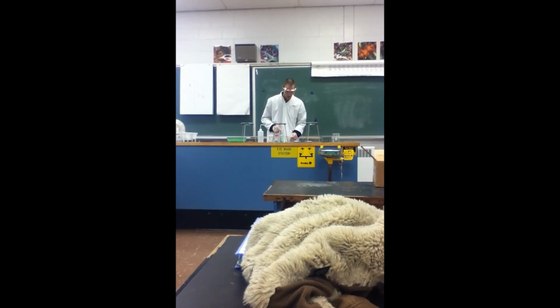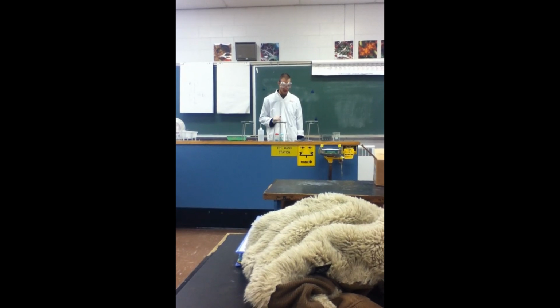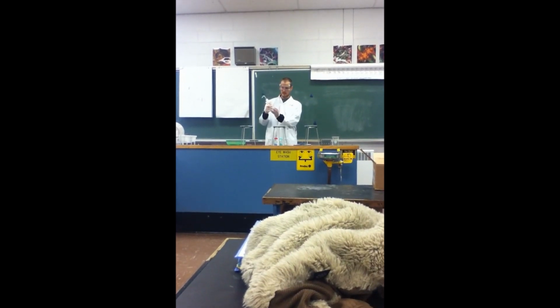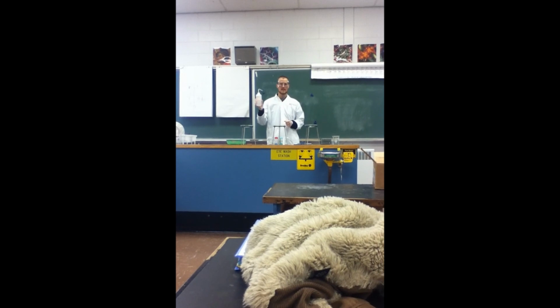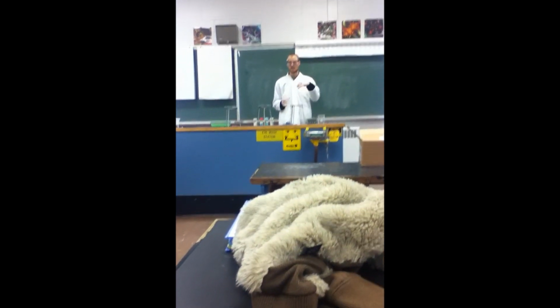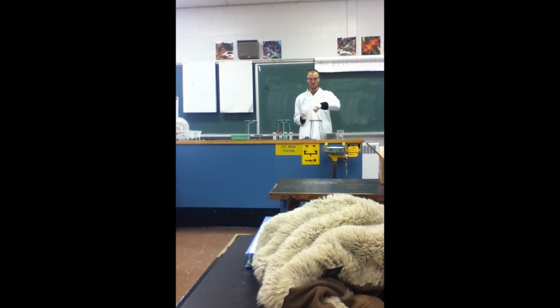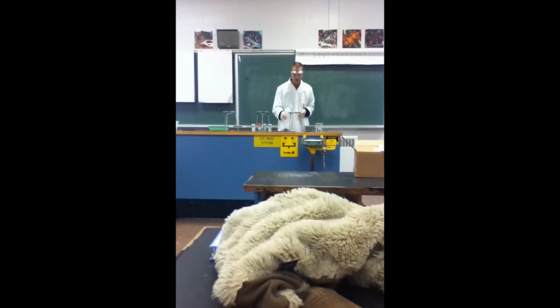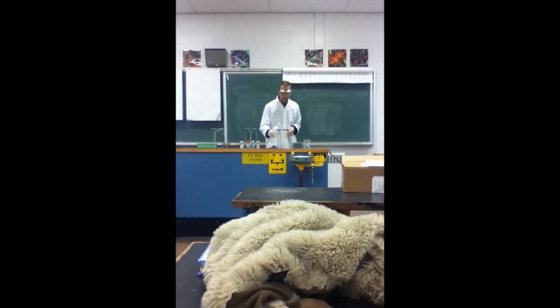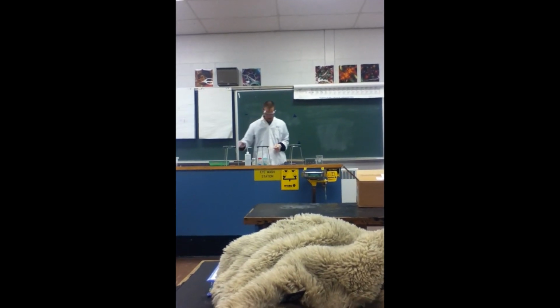Okay. All right, so we've tightened our tripods and we've placed the watch glass on top. From there, we are going to add ethanol. Okay, we have ethanol here, which is a fuel that burns quite slowly. Okay, you can drop the match onto the ethanol, and once the ethanol lights, it burns quite slowly. It doesn't just all fire up at once and then it's gone. Okay, so what I'm going to do is squeeze on just a little bit of ethanol. Okay, that should be enough for us.